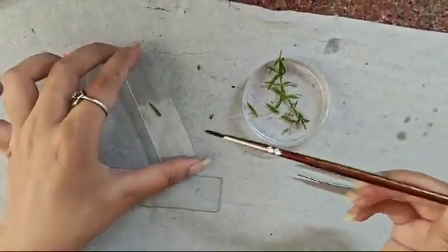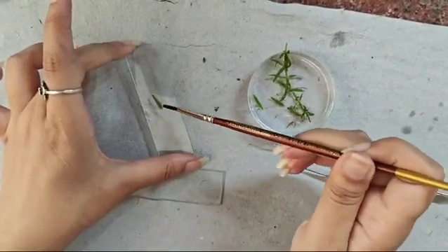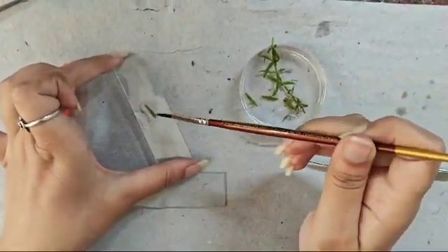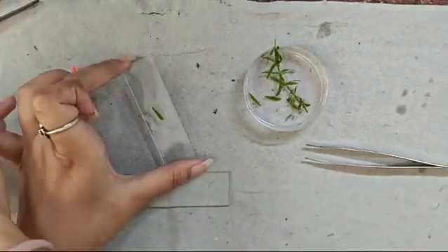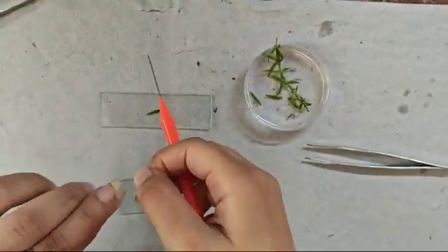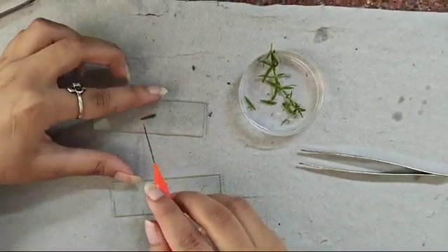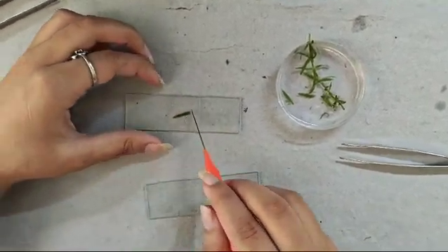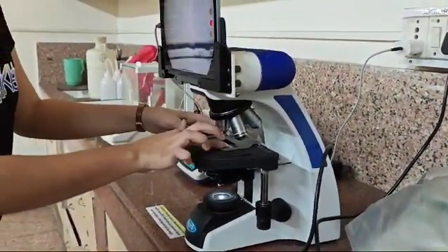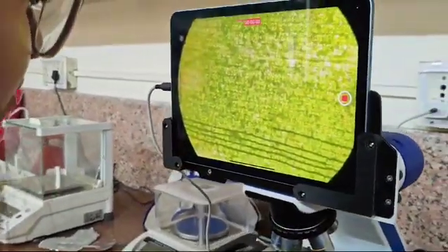Carefully putting the leaf on the slide, we take some water drops — we can use a brush or a dropper to do that. After putting the water drops on the hydrilla leaf, we have to gently place our cover slip; we can use a needle. We have to be very careful to avoid all the air bubbles. Now we have a slide, and using this slide we can observe cytoplasmic streaming.